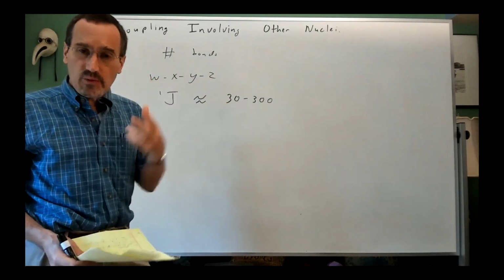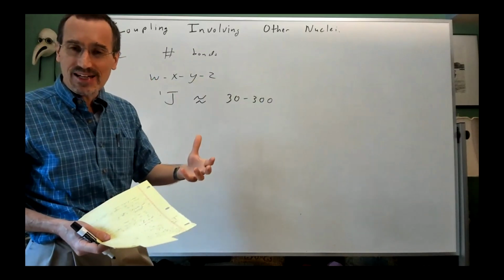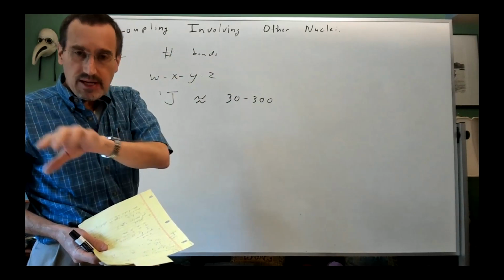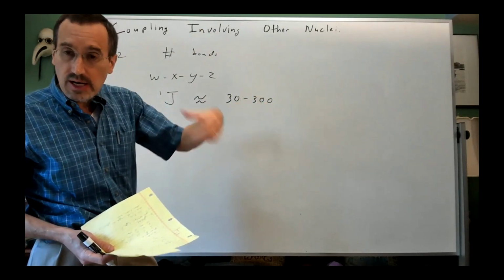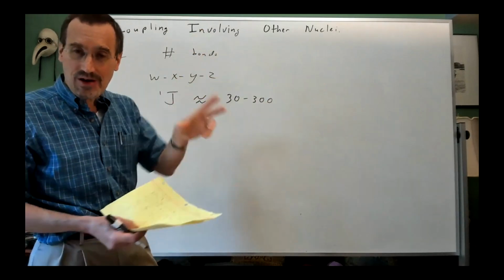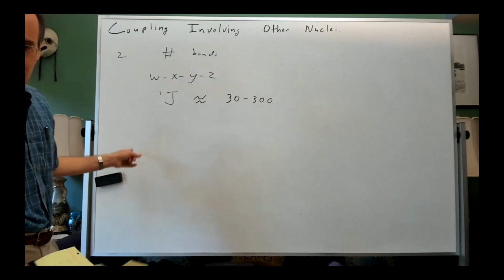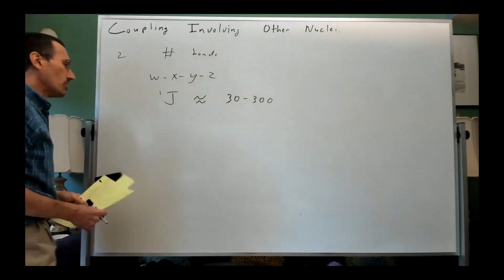I see this often with new people in my group, when they take an NMR of a trifluoroacetate salt, and the trifluoromethyl group, the CF3 carbon in the C13 NMR, is a quartet, but the lines are over a ppm apart, and people may not initially recognize the pattern of a quartet, particularly since the outer two lines are going to be a third the height of the inner two lines.